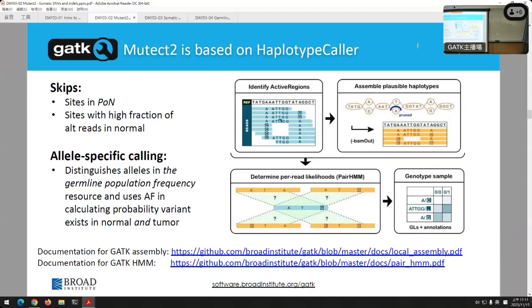And there are also complications. There are changes to the haplotype caller because you might remember in the haplotype caller, after we assemble potential genotypes there, we then compute the likelihood: is it AA, is it AT, is it TT? We compute those. But things get complicated on the cancer side because you have different cell populations in there and everything else, so we don't always see the reasonable allele frequency. For instance, we don't see, oh, it's a het call, that means it must be 50-50. Well, we might not see 50-50. So at the part where we list out our frequencies and calculate likelihoods, we can't use the standard assumptions of ploidy here. That's another tweak we have to make deep inside of it. I don't worry too much about it, but that's one of the things we're doing here.